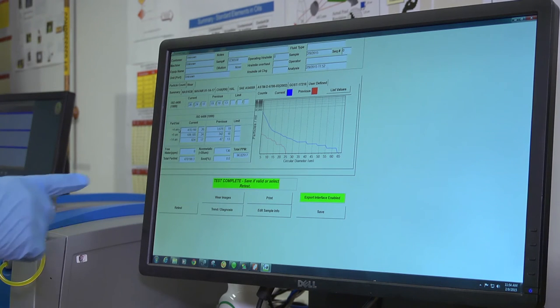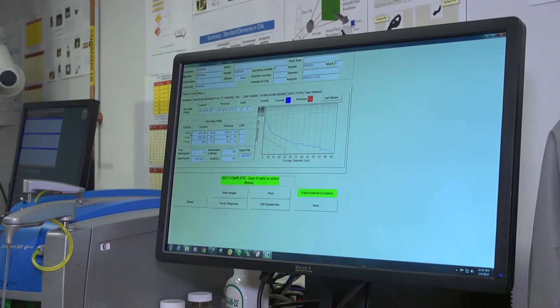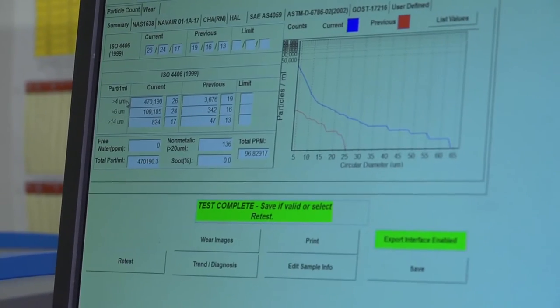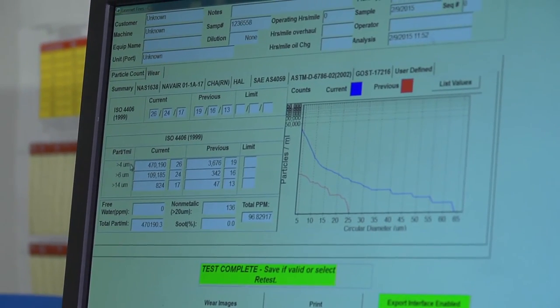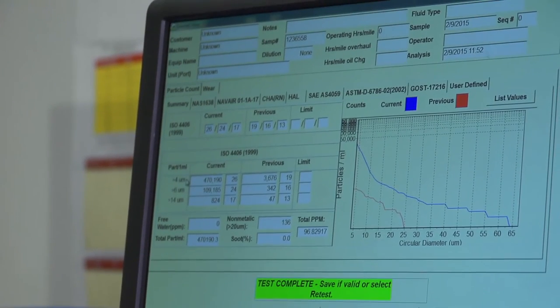So that's the particle count results in terms of the basic ISO codes. There's also a measurement of non-metallics. It showed that there's 136 particles that are non-metallic greater than 20 microns. That's a parameter that comes out of the LNF wear image capability.